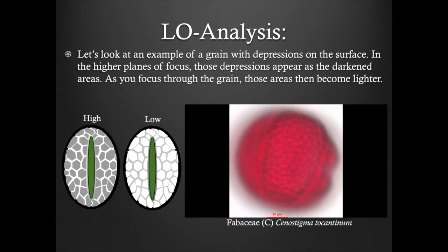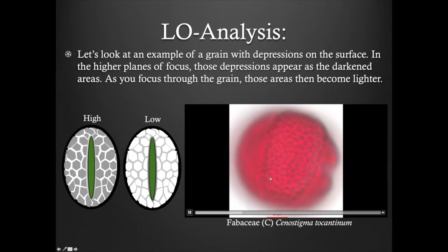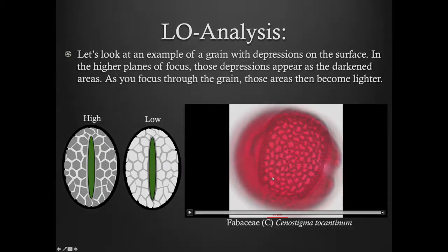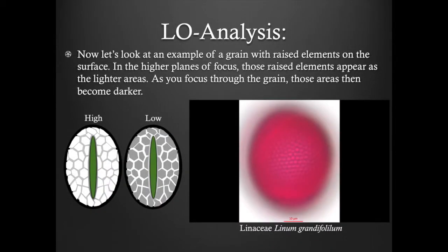Let's look at an example of a grain with depressions on the surface. Take a moment to watch the brief Z-stack video below. In the higher planes of focus, those depressions appear as darkened areas. As you focus through the grain, those areas then become lighter. In the higher planes of focus, those raised elements appear as lighter areas. As you focus through the grain, those areas then become darker.